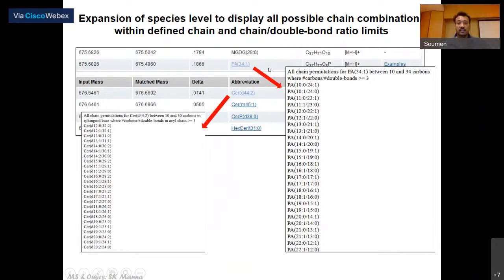As we have discussed, there are very high resolution instruments. For example, we have sub-ppm level of mass accuracy if we look into the Orbitrap or FTICR MS. However, even with zero error, if you are trying to identify a lipid, this is what you will end up with, because all of them will have exactly the same formula and same mass.